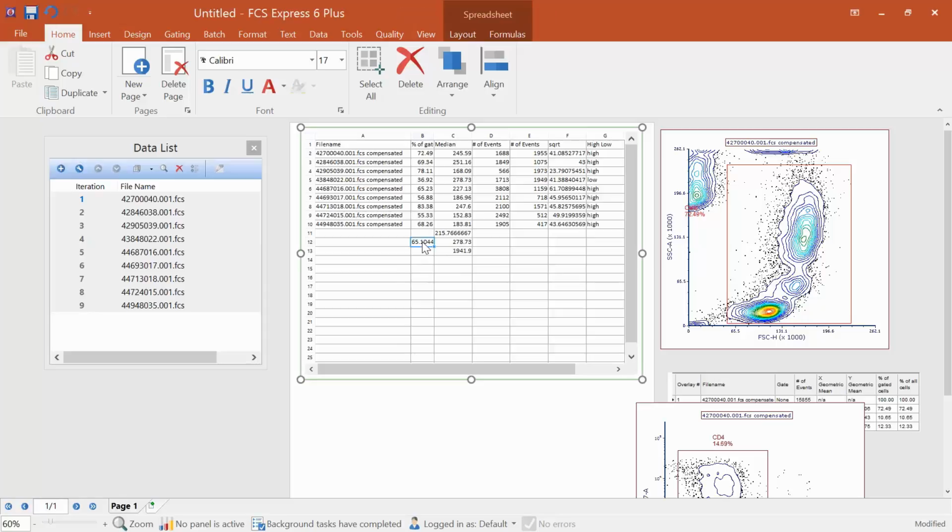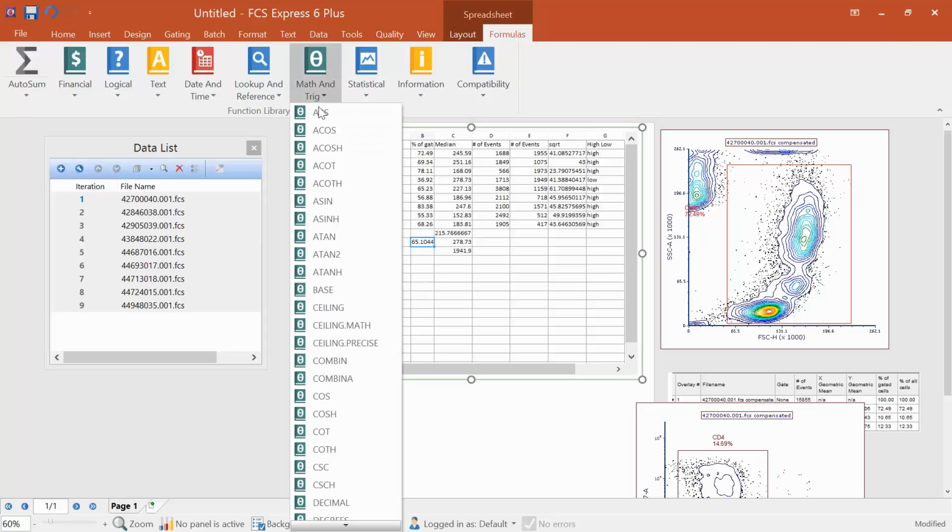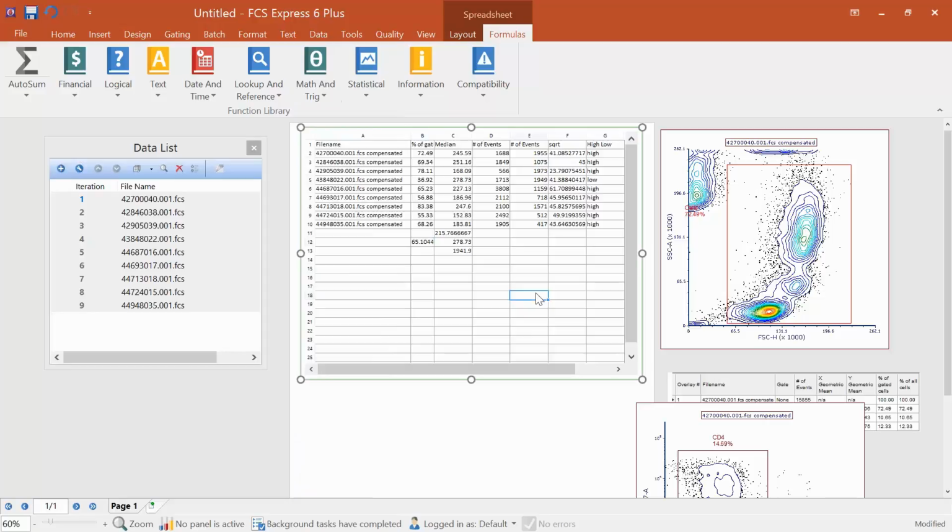And again, the other thing I showed you here is if you just wanted to type in a formula, if you know the name of the function or the operator that you've been using in Excel, here we entered an average, you can do that. But again, you could always look through the list here, or you can look through the function library in our manual, or even search that to see how we actually use those functions.